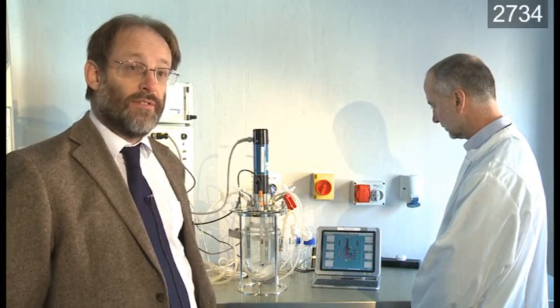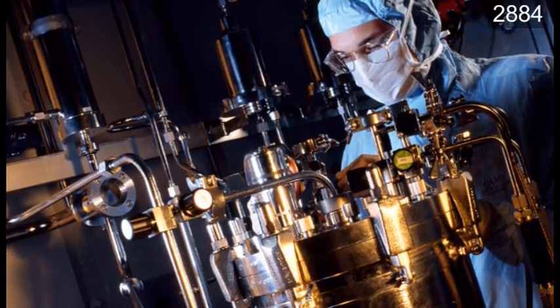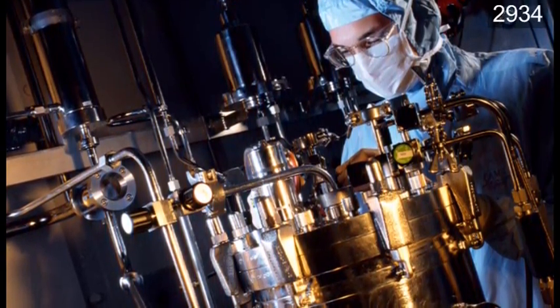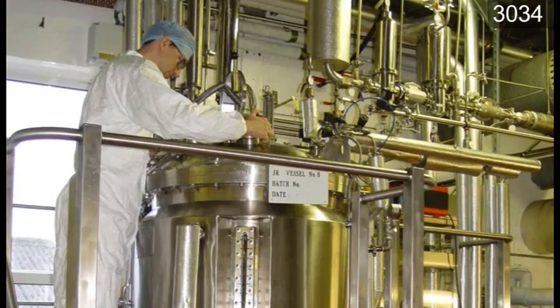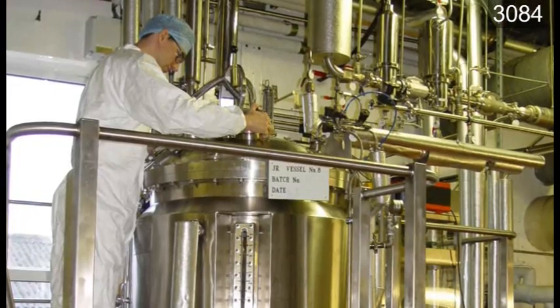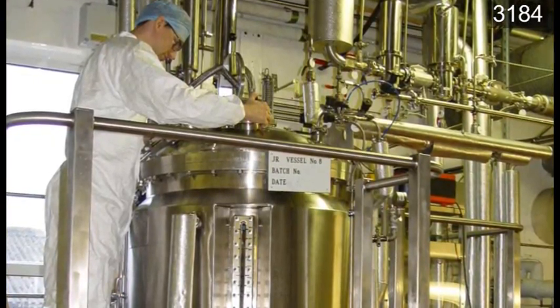We have a range of fermenters at a range of volumes which we can run under different conditions. For example, we'd have around half a dozen of these fermenters, which would be the initial screening stages. We can then scale up through 8 litre fermenters, 50 litre fermenters, 100 litre and 250 litre fermenters.